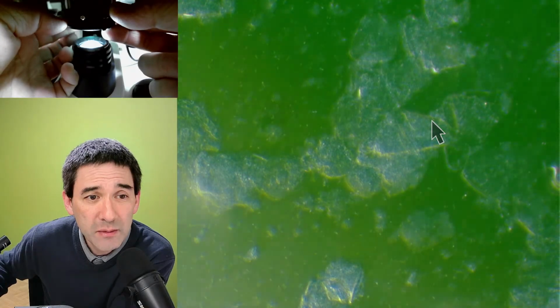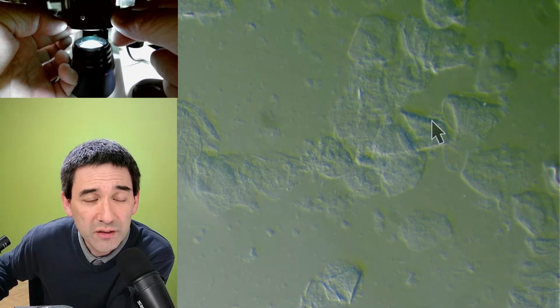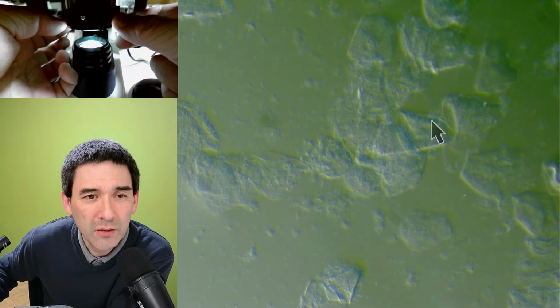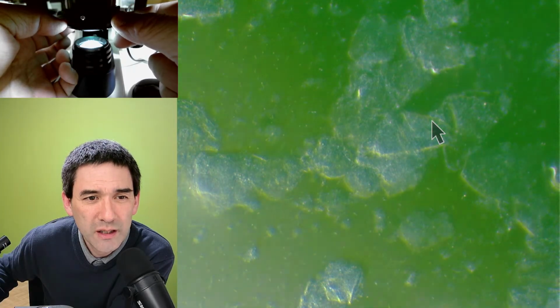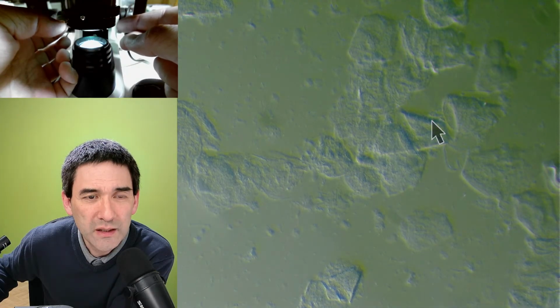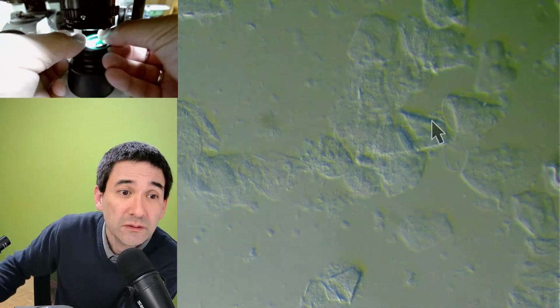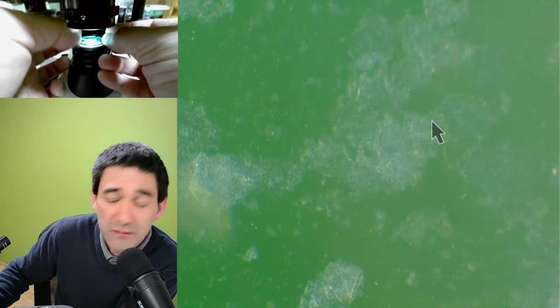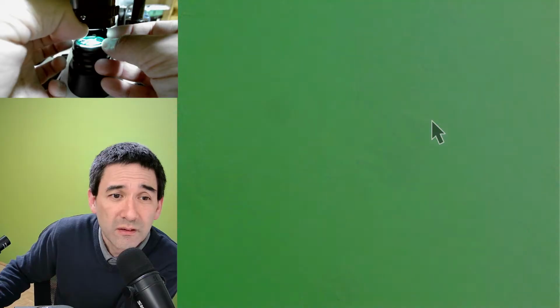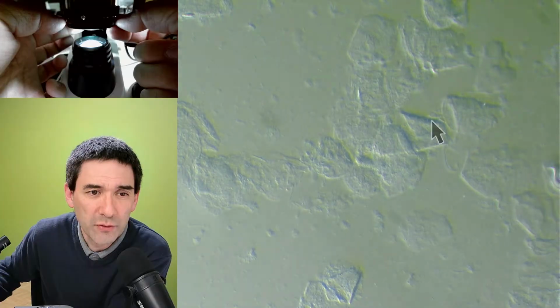Move it over like this, maybe. Then we're going into oblique, and we're kind of losing the color again. Now we got a little bit of greenish color here. It would be really nice to make sure that the background would be green. Maybe put some green over the lamp directly. Maybe that does the trick. No. So as I just said, it's a question of trial and error, right?